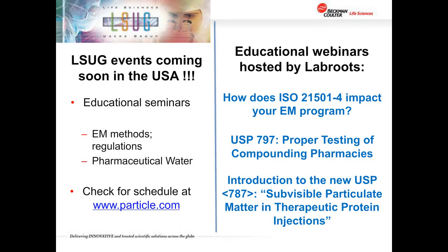Oh, that's great. Our next question comes from Dominique, who asked, our question concerns the new ISO 21501-4. What about concentration limit measuring during calibration? Generally, concentration limit, and I think Dominique is probably looking at the maximum level, is something that doesn't need to be tested at each and every 21501-4 calibration in the field.